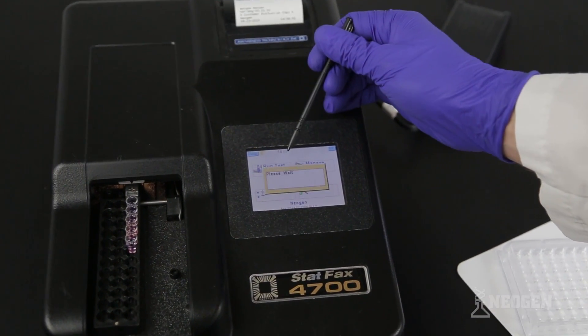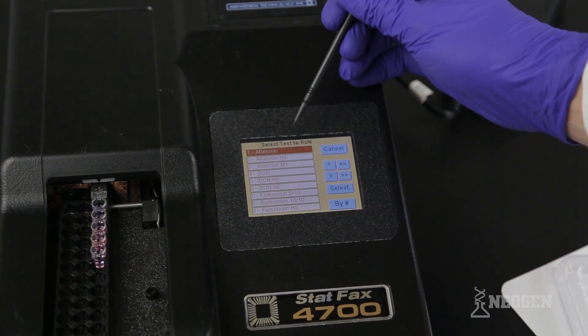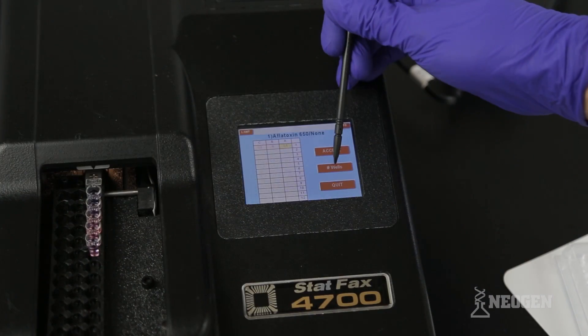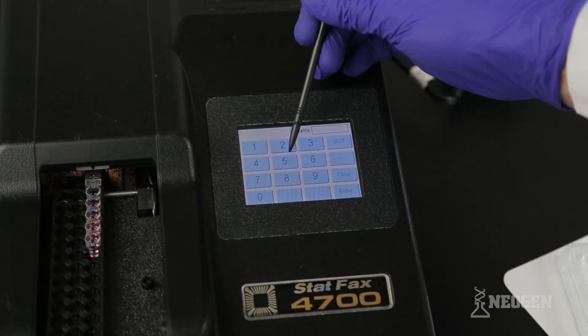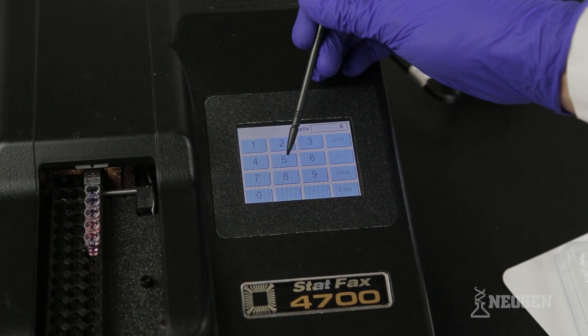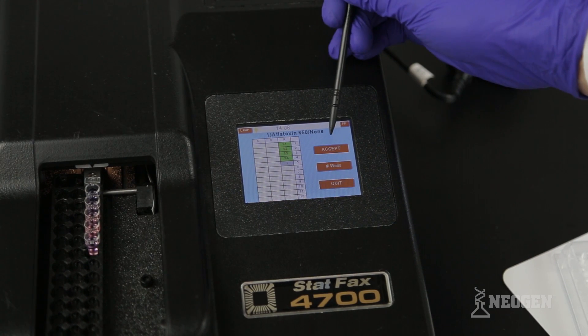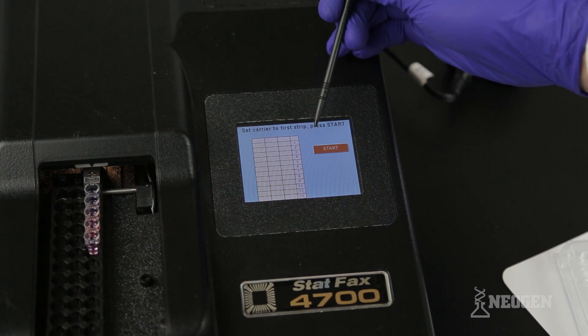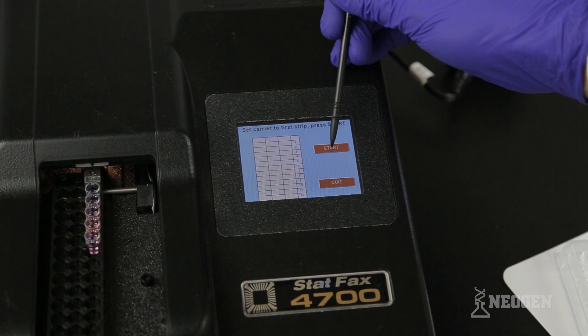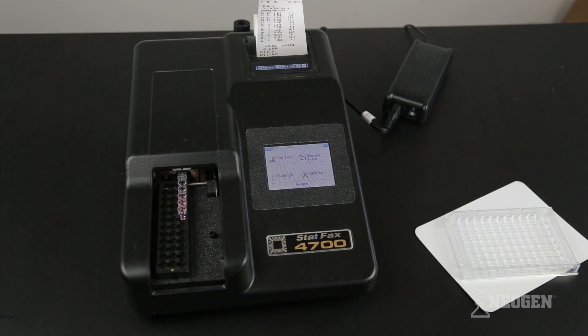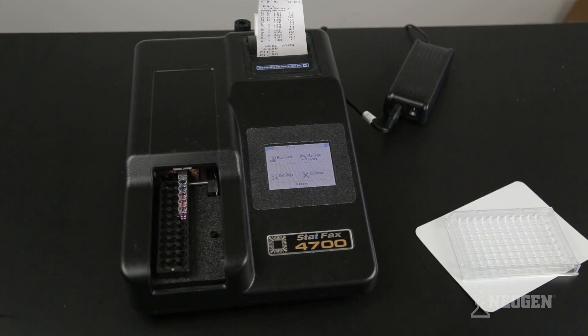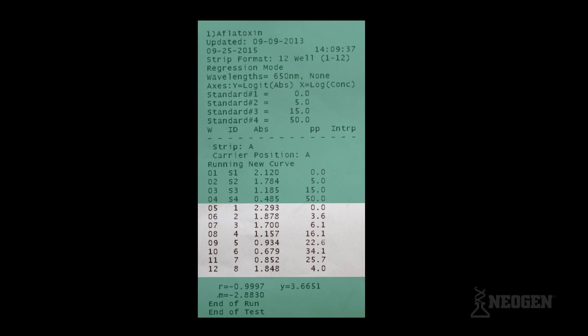Select Run Test. Select Total Aflatoxin. Select the number of wells you want to be read, then push Enter. Select Accept. Select Start.